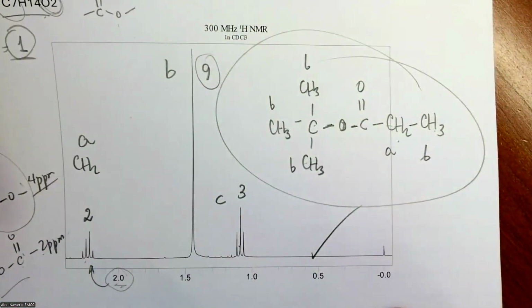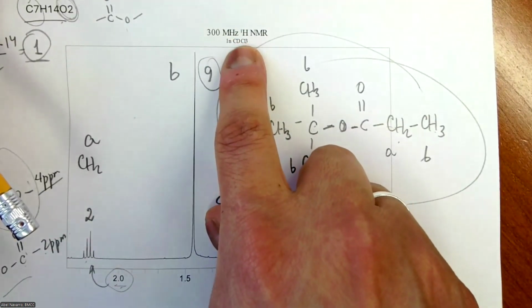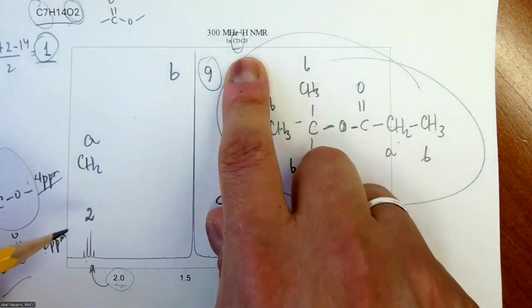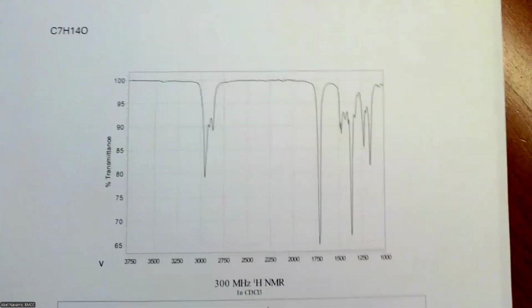Okay. That is the power of the NMR, 300 NMR. CDCl3, that's the solvent. You see, it's deuterated, has deuterium inside. Okay, so that's what I have for NMR. Now let's do some of the combination, the combo. Combo is the IR NMR system.